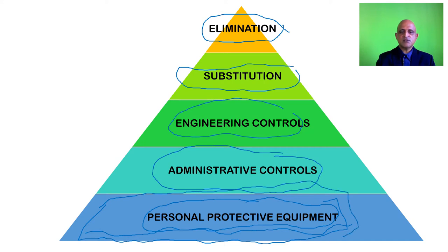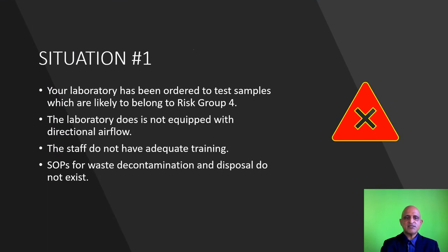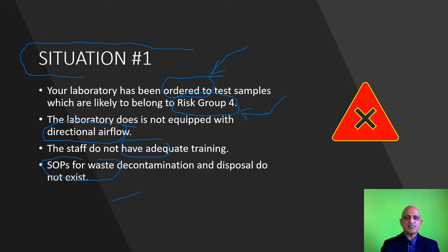The first control is elimination. Consider this situation: your laboratory has been ordered to test samples likely belonging to risk group 4 — for instance, during a pandemic. However, your laboratory is not equipped with directional airflow, you do not have a containment facility, the staff lack adequate training, and SOPs for waste decontamination and disposal do not exist. With these multiple limitations, a breach of containment is highly likely, and in this case we resort to elimination — a collective decision not to proceed with the laboratory procedure.